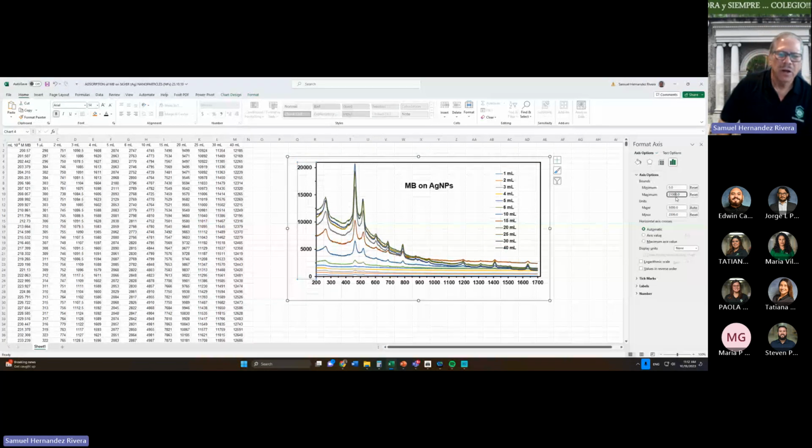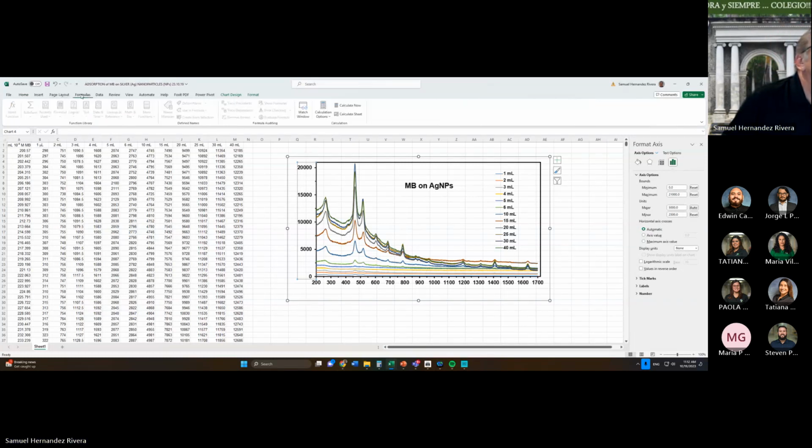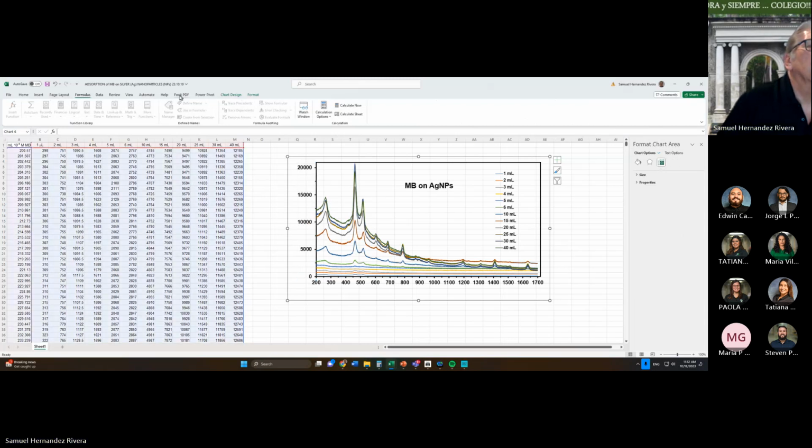Okay, but okay. What's left? Labeling the x and y axis. So now you go to, you're forgetting. So bear with me.